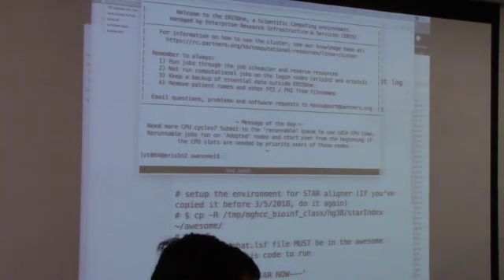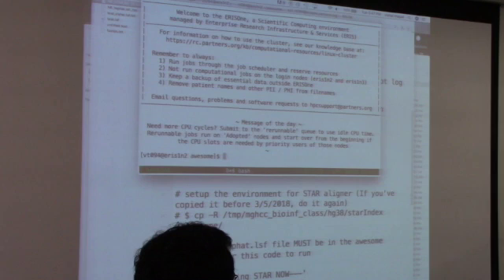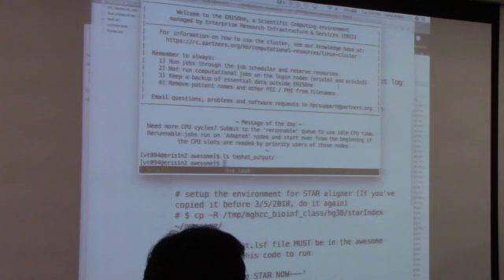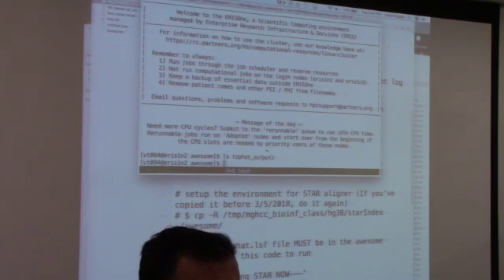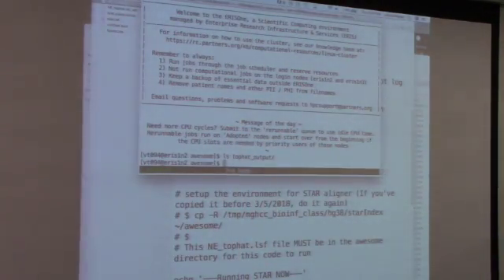So after running the top hat job, what are we going to get in the output? You are going to get this. Apparently nothing. Yeah, I didn't get it. I didn't get anything after running it. I submitted, it finished, and I didn't find anything in the output. Okay, so let's look at your error files. If you don't get anything, then let's look at your error logs and see what happened.